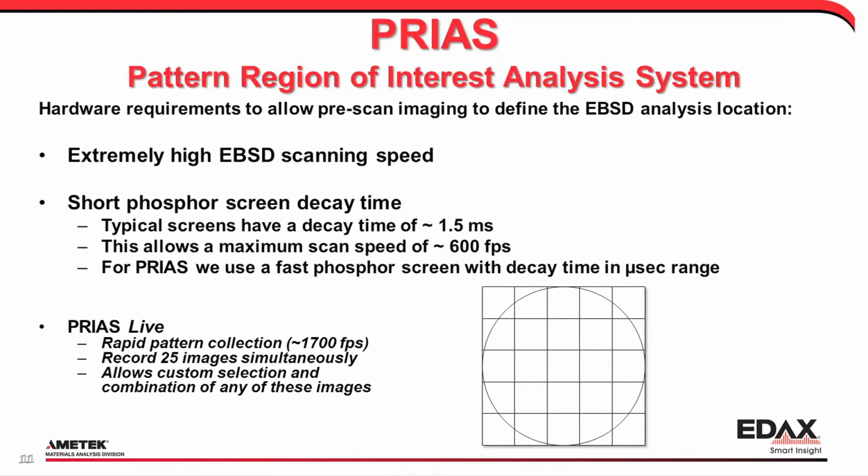So the joke is, yeah, it may take us 30 seconds to collect an image, but if we take the time per image, all of a sudden it's a very fast technique. You have to get 25, but you end up with a suite of images you can really work with, and I'll show you some examples. Once you have these, you're able to start doing your old classic A plus B, A minus B, but with a much more expanded capability to work on these different contrasts.